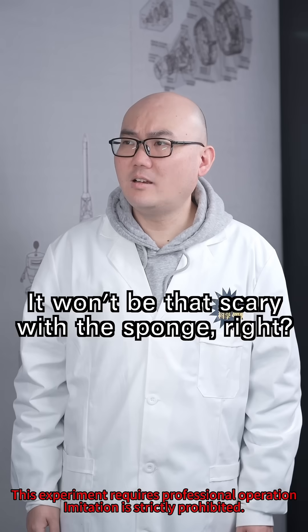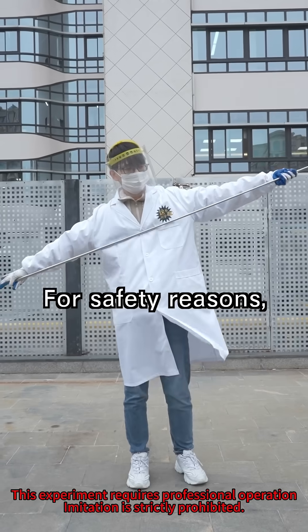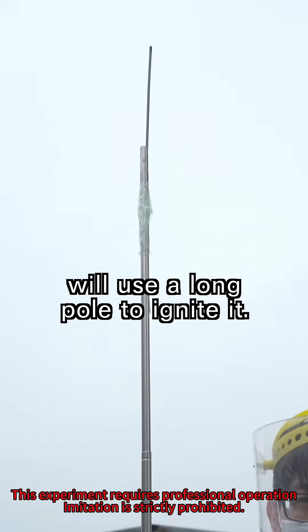Finally, the sponge. They won't be that scared with a sponge, right? Let's wait and see. Not only can it fully absorb liquid oxygen, but it's also flammable. For safety reasons, the experimenter Mr. Zhang will use a long holder to ignite it.